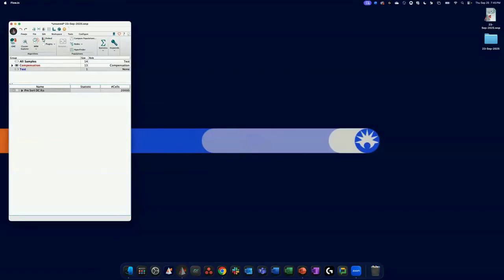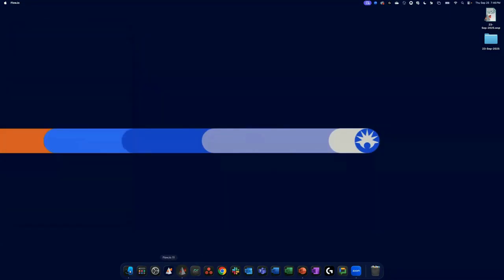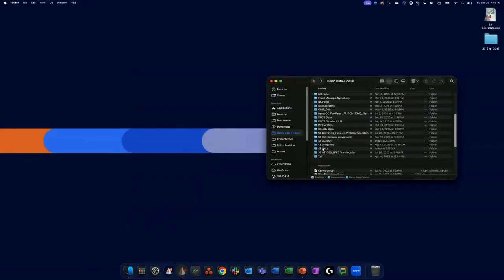So let's say with this data, I've already spent some time in the workspace filtering parameters, and I did some scaling. I'm generally okay with the compensation, and I don't want to do any new unmixing. So let's talk about the CellView Lens plugins. I'm going to open another workspace, because although this one has images, I don't find them super biologically interesting. I liked this data set because it had single stain controls, but I'm going to open a different data set that lends itself better to demoing the imaging properties.